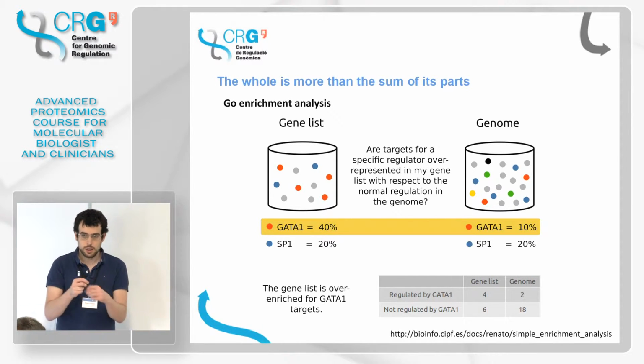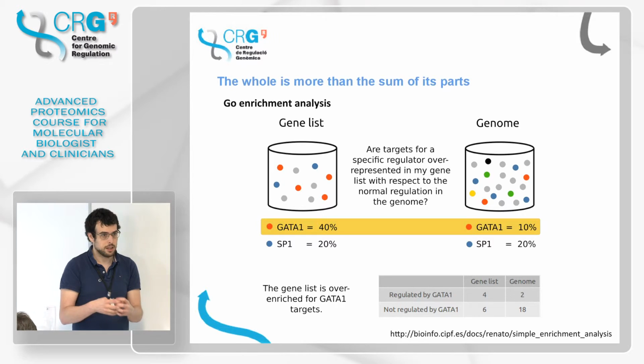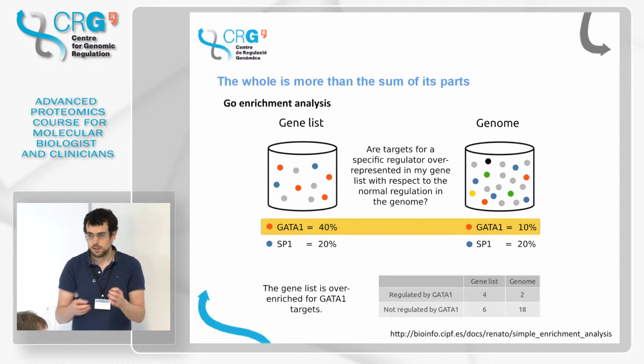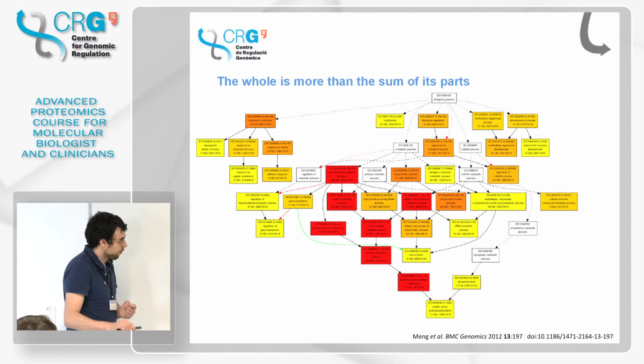This would mean that whatever perturbation I'm inducing, it's affecting very much all the kinome, okay? And then this would give me clues on the mechanism or the response that the cell is doing once we stimulated it with a particular stimulus. So what you would see, for example, is one representation of Go term enrichment, in which you can see this hierarchical structure.